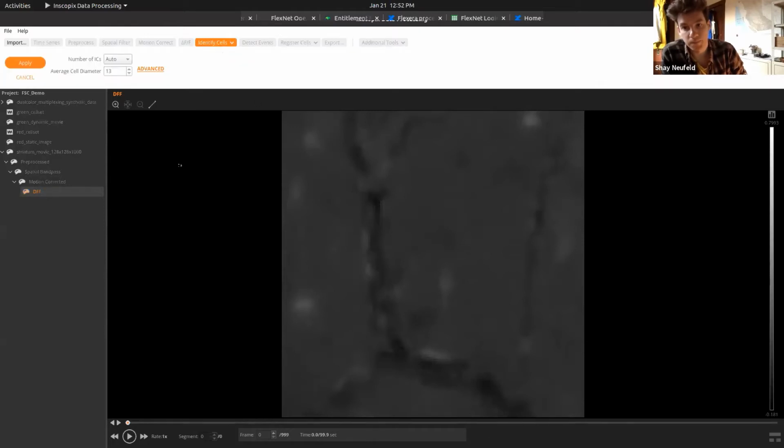But it will be in pixels then, not. Yeah, you need to enter in the parameter asks for the cell diameter in pixels. I see. Okay. Sorry, I was thinking about a different function. Is there any function in IDPS that asks for the cell diameter in microns?